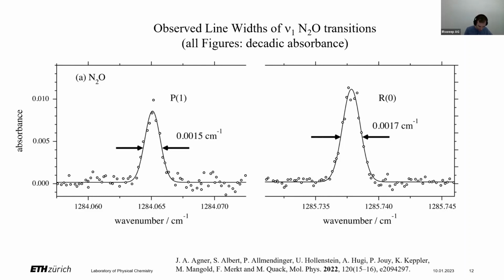Patrick Dupre writes, what are the potential spectral ranges of the instrument? Maybe I can answer this question. Overall, QCL frequency combs can be produced in the range around 1,000 wave numbers, maybe a bit below 1,000 wave numbers, up to 2,300, maybe 2,400 wave numbers. Most combs that we have on offer are so far in the range 1,000 to 1,800 wave numbers.